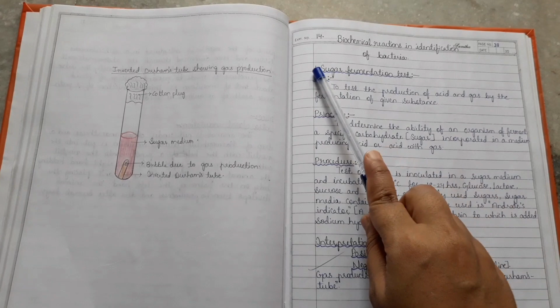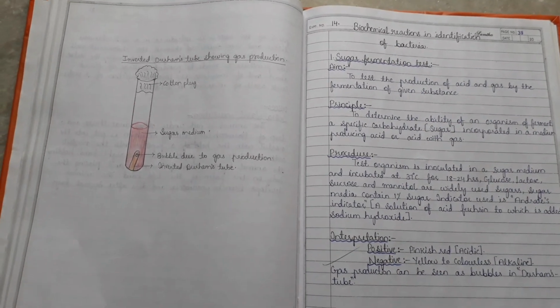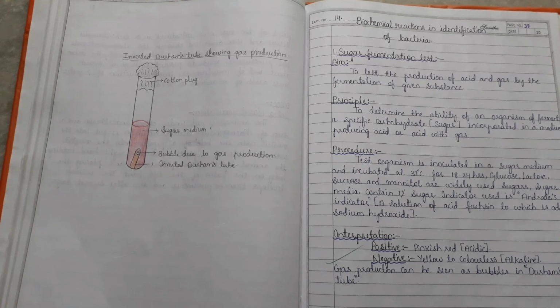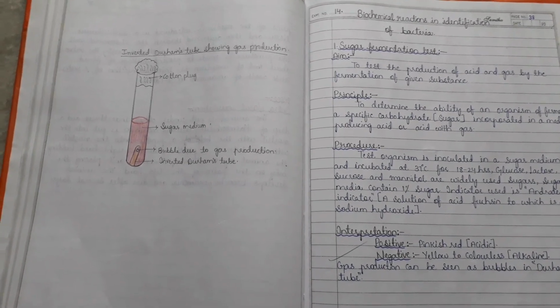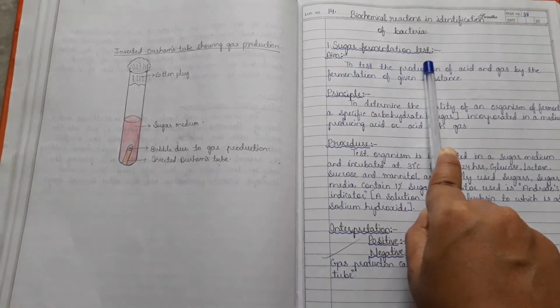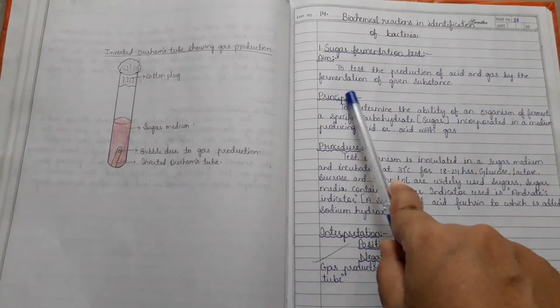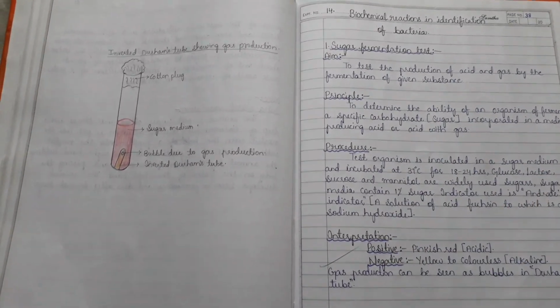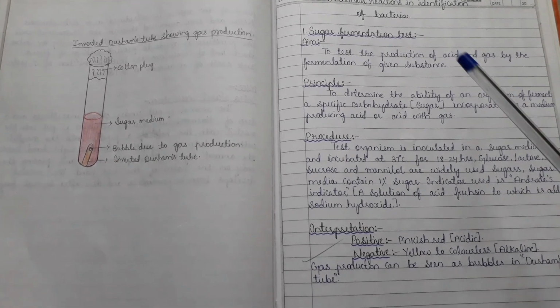So the 14th content is biochemical reactions in identification of bacteria. So what are the biochemical reactions we will see? Sugar fermentation test, to test the production of acid and gas by the fermentation of a given substance. So yeah, this is the principle.